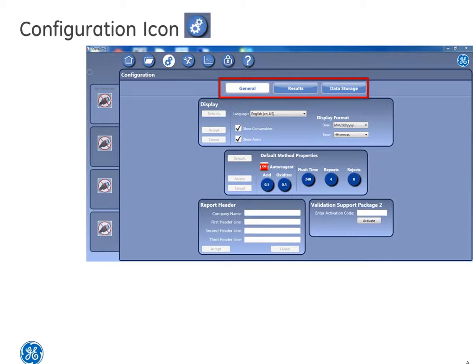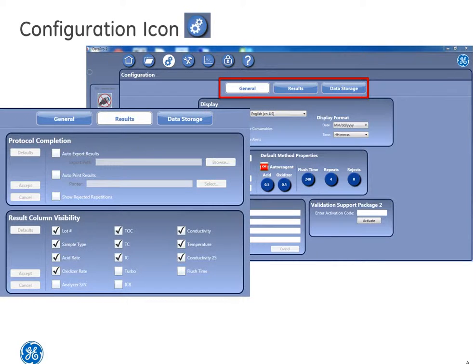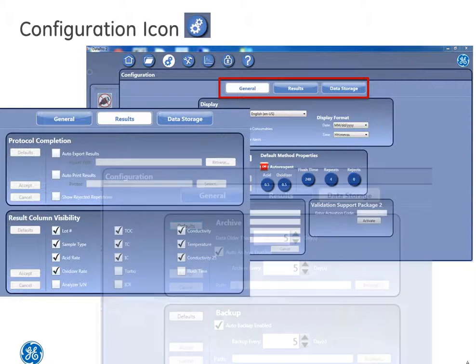All three tabs are important to the user interface for DataPro2. These functions allow users to set up default properties for methods like flow rates, display options like time and language, and archive and backup frequency.